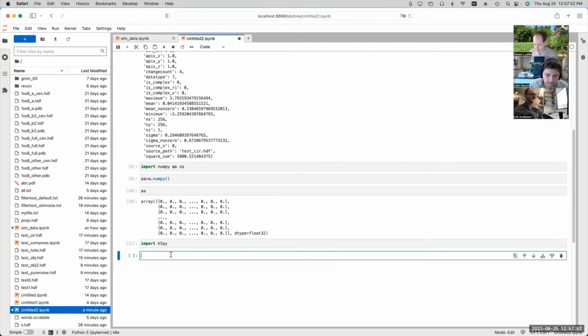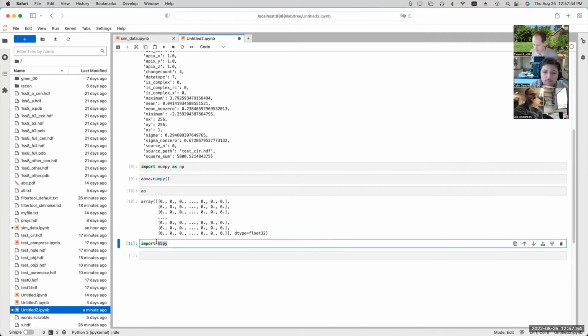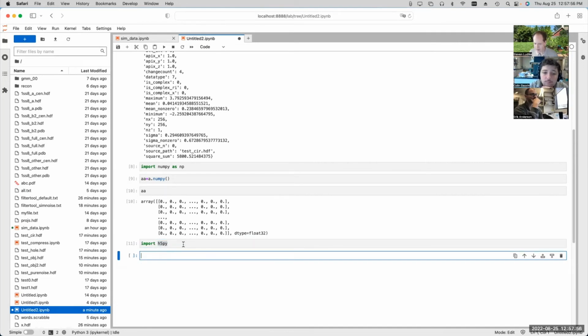Now, the reason I mentioned this, aside from the fact that someone might think to do that, is that if you look at TensorFlow, once you've built up, say you use Keras and TensorFlow to build up a big neural network, and you've trained the neural network, now you need to save the trained neural network to disk.